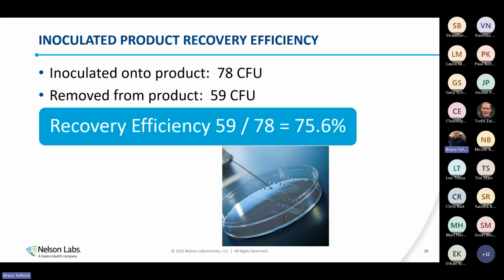So inoculated recovery efficiency, the math really works out quite simply. It's the amount of inoculum we recover from the product divided by the inoculum we put on the product. So we are going to inoculate onto the product. One of the first things is that potentially we can actually lose inoculum. Sometimes we have very fine things.